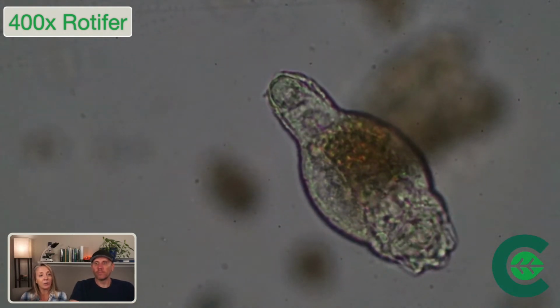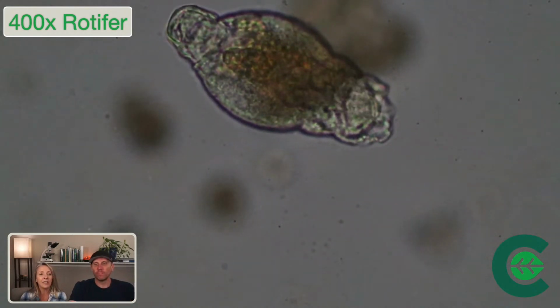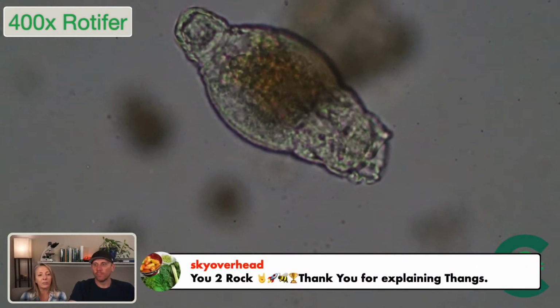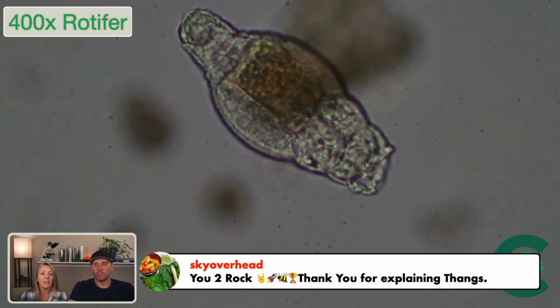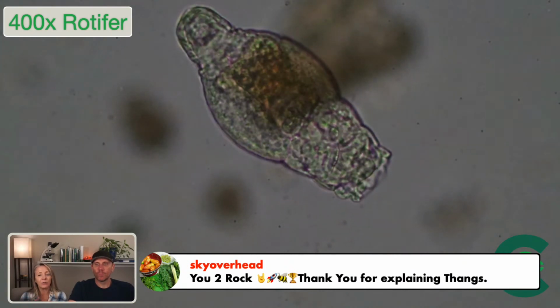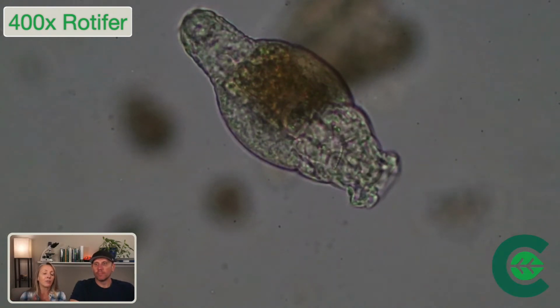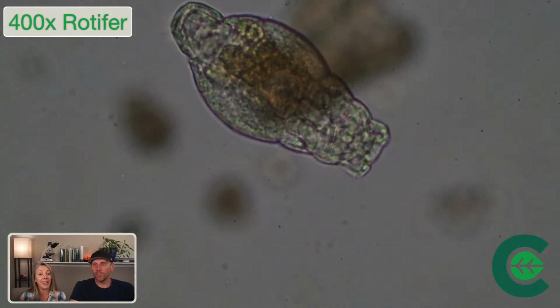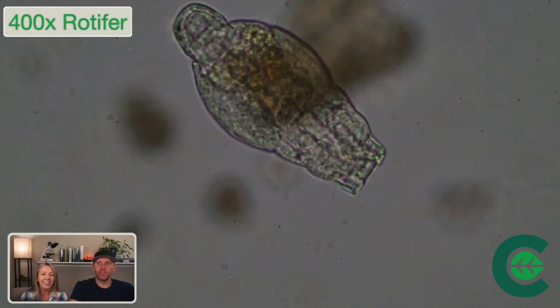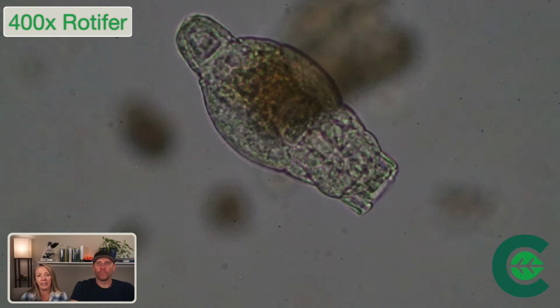So this is also at 400x where we do our identification. This is what we call a rotifer, cute little guy, but he is also an anaerobic indicator. So again, if we see one of these guys in the soil, we're not going to freak out if we have beneficials in the soil, but we are going to understand, we are going to take action, if over time these guys start proliferating in the soil.